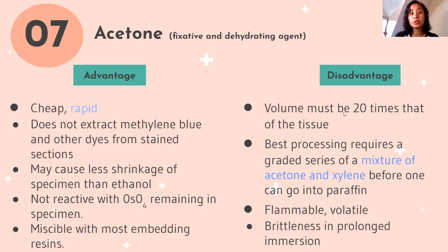However, you should use more volume because it's highly volatile. Yeah. And flammable. And you have to be very careful because if you use it for a long time, it could turn the tissue brittle.